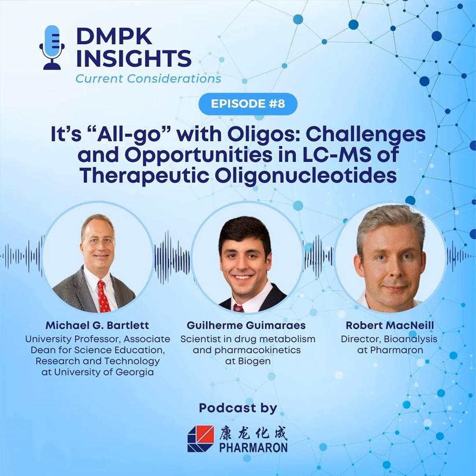But I've also observed, just from a quantitation perspective or a targeted quantitation perspective, is that in HILIC you also see the charge states change, right? You're working with higher charge states, and when you're developing some of these targeted MS/MS methods, and you're fragmenting these, they may not fragment as well as some of the lower charge states that you may get with ion pairs. And so it's almost like you're losing sensitivity twice, right? Two different factors, you're immediately affecting your sensitivity. And so, like you mentioned, with a different chromatographic scale, it's advantageous to try to recover some of that sensitivity loss. And it's exciting to see the field adapting to it.